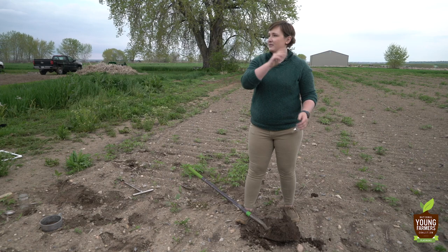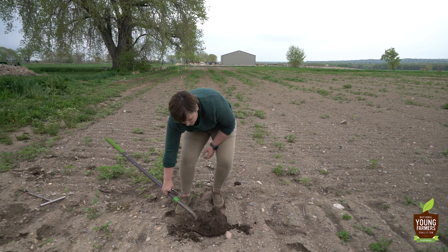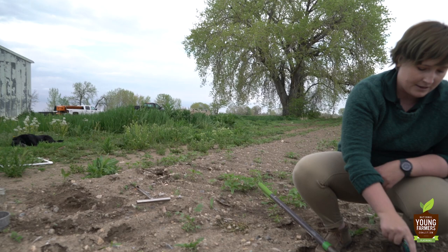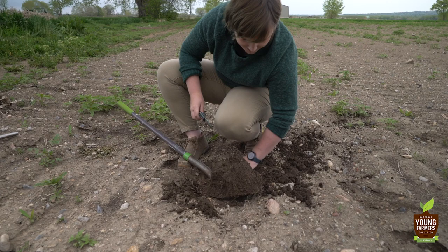Your goal here is to take a soil core like you would be taking with your probe. It'll just be bigger, right? I didn't do a super great job on this one, but for sake of time, we'll hurry along. Butter knife, putty knife, pocket knife, whatever you've got. You're gonna just cut off the sides. Kind of chop off the sides.